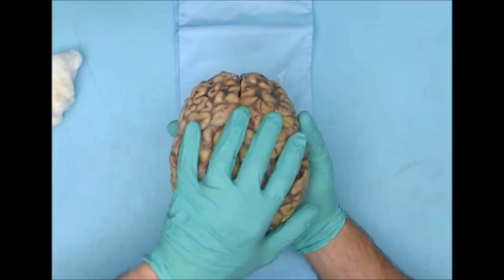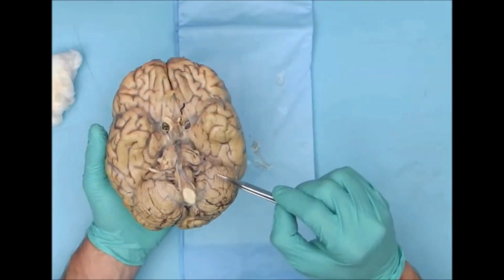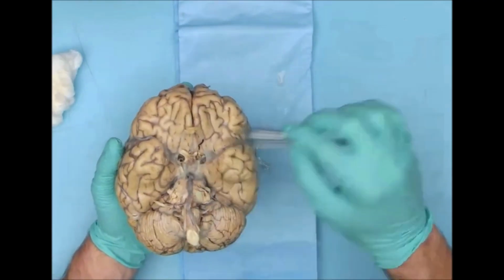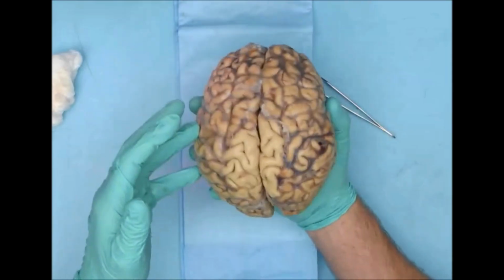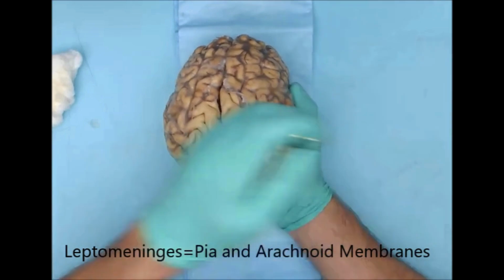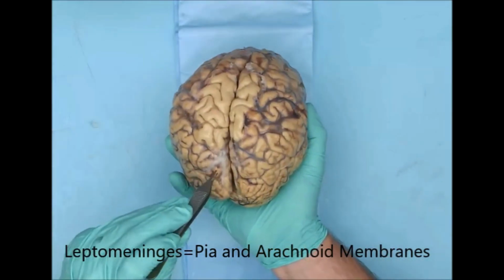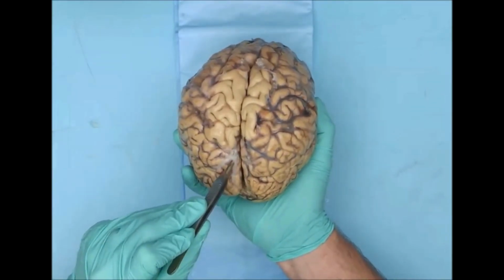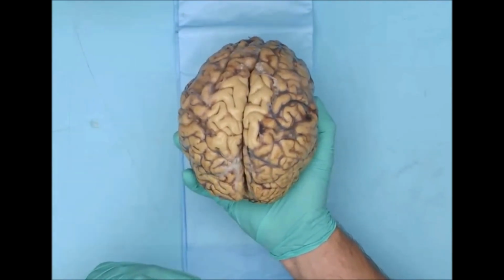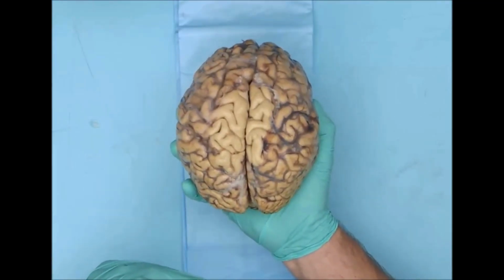So as you see, we've got the cerebrum here, the cerebellum here, pons, midbrain down here, and it's unfortunate it's kind of disrupted right here, but the leptomeninges is kind of torn away. But if we take a closer look in this area right here, there's these little granular areas which are called arachnoid granulations, which a lot of people mistake for tumor.